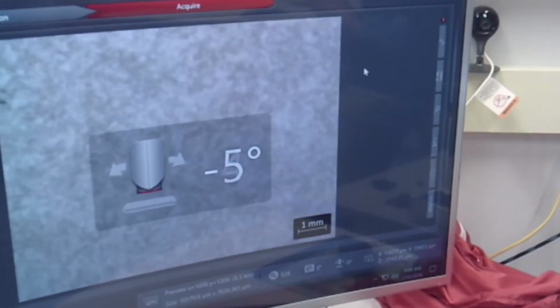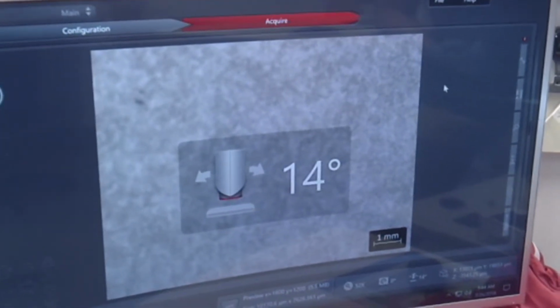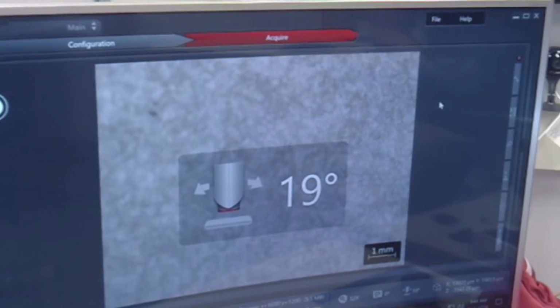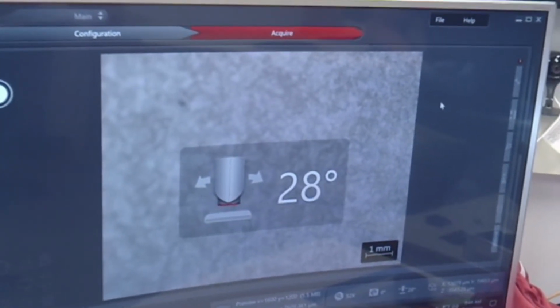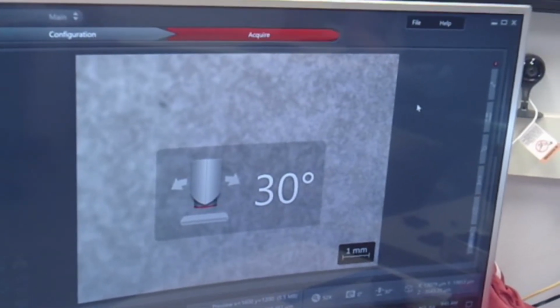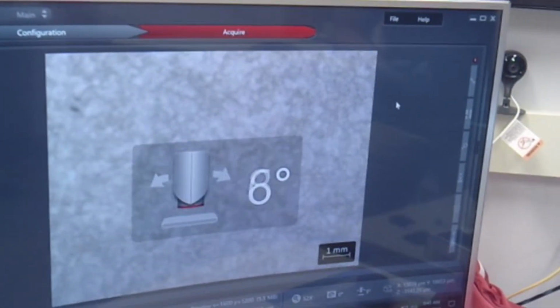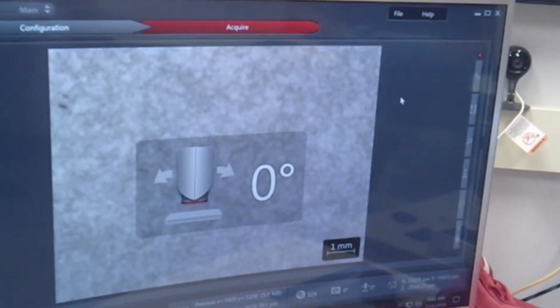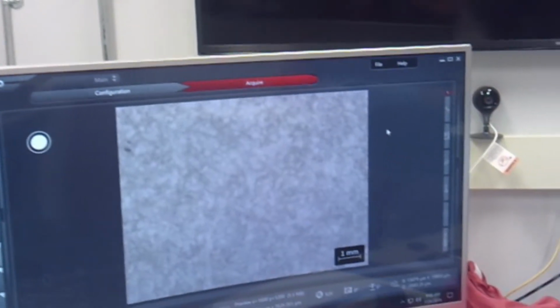This is also going to be reflected in the software. As you can see, if you over-rotate, you'll start to hear the microscope start beeping at you. It will start beeping at you, sort of a faint beeping noise, so just be very alert when you're rotating it, as it could potentially damage the instrument, so just be careful. But overall, it's a very useful technique.